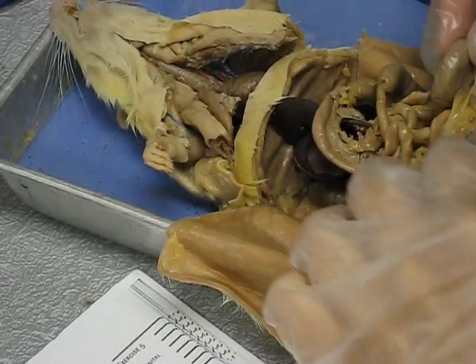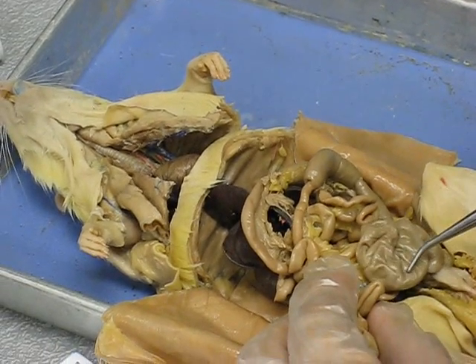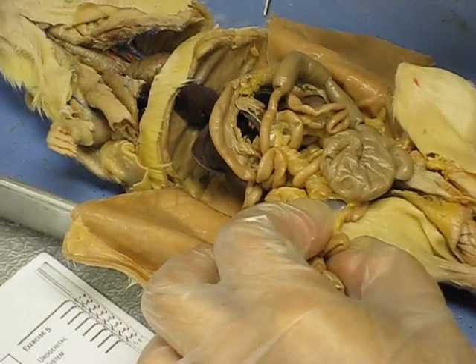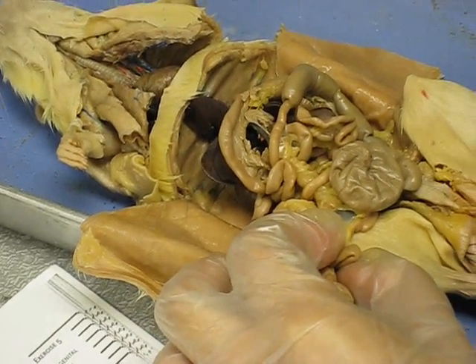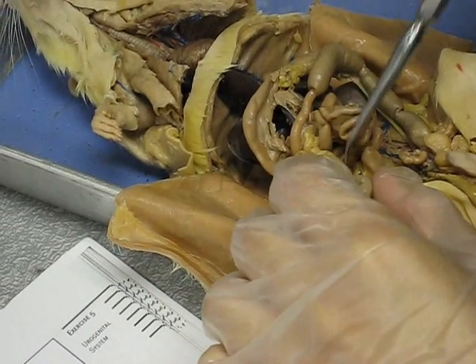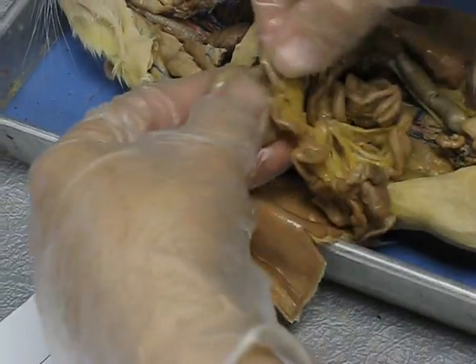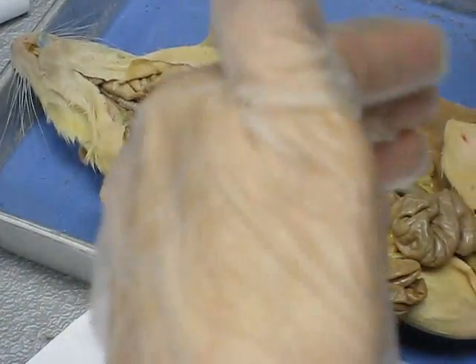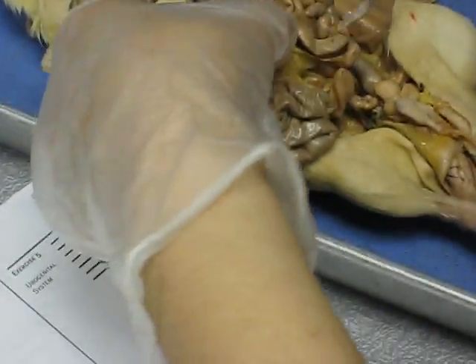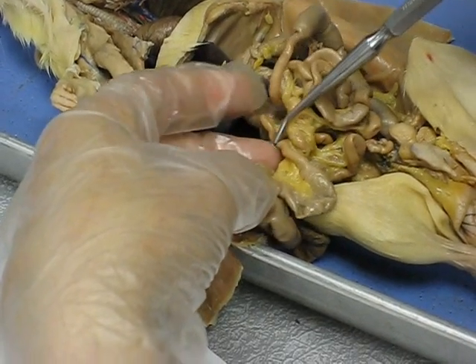Connecting from the small intestine to the cecum is another special portion of the small intestine — the jejuno-ileum — and it enters the cecum. So if we have a pin close to the cecum, that part of the intestine is the jejuno-ileum. Before the cecum, it enters the cecum; then you have the cecum, and what leaves the cecum is the start of the large intestine. It would be difficult to unravel everything to pin it, so you just want to be able to tell which enters and which leaves.